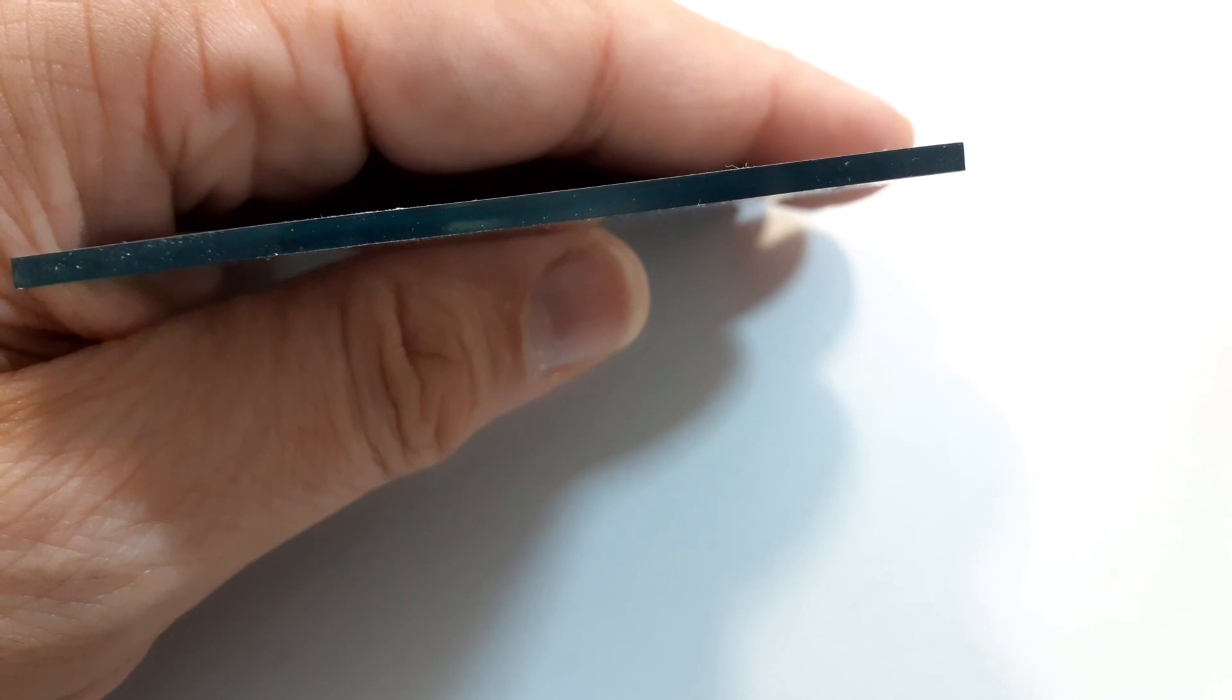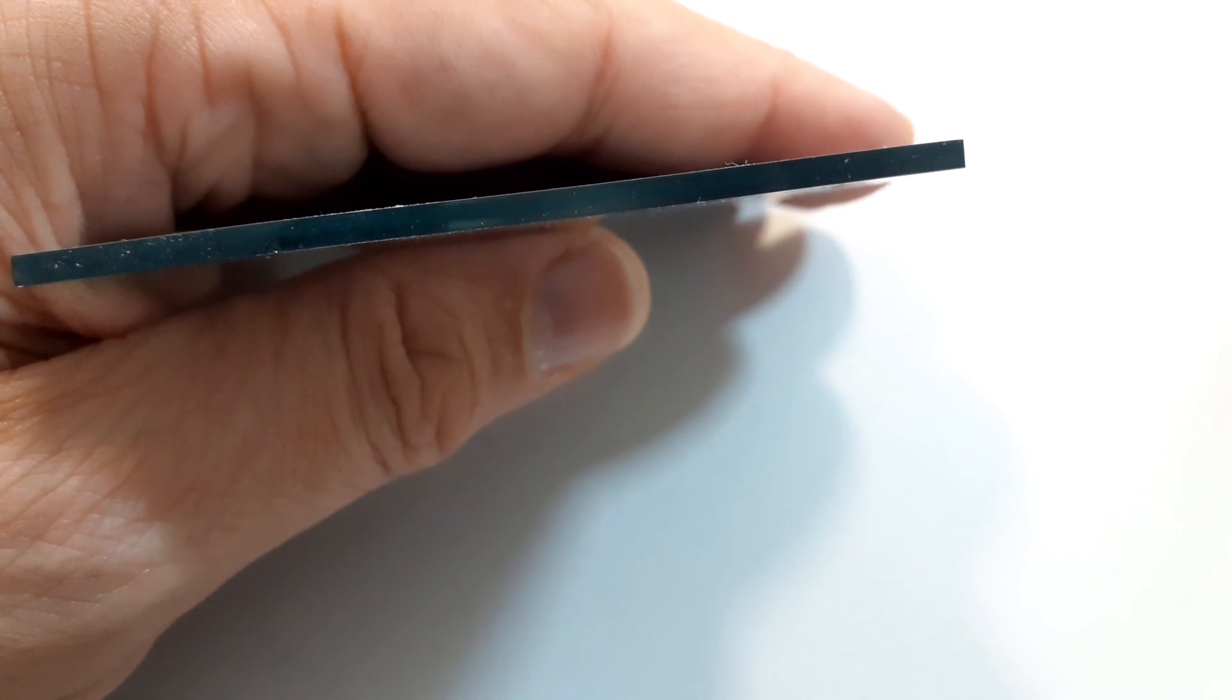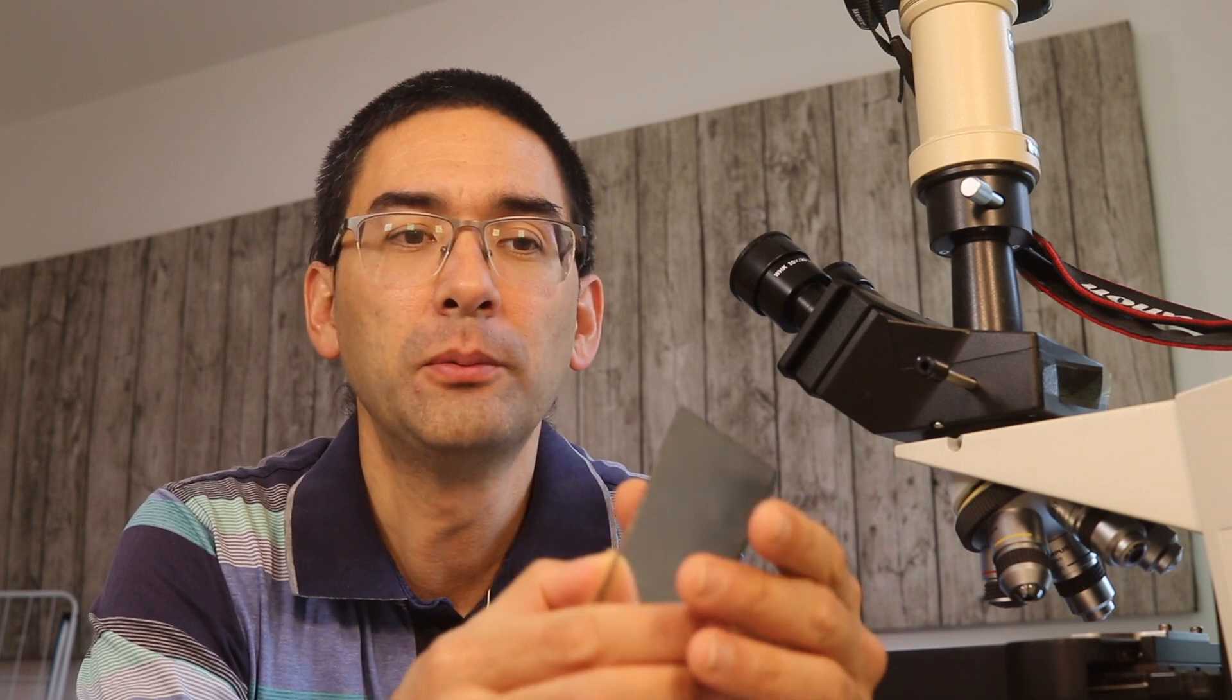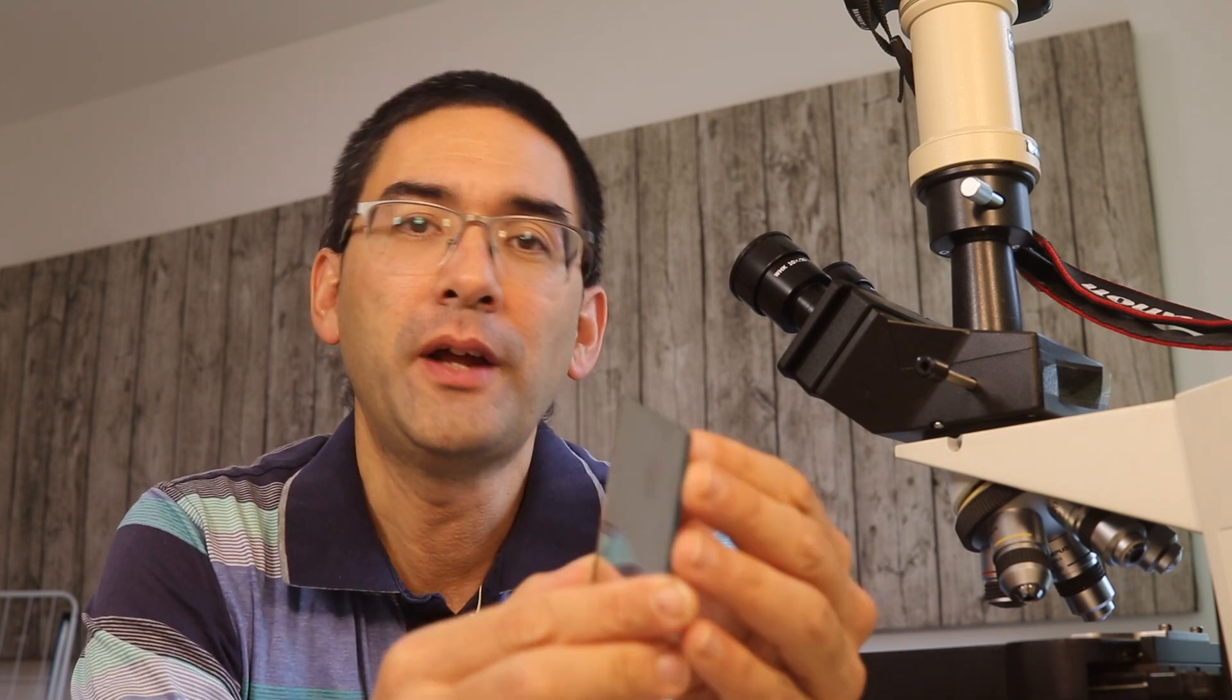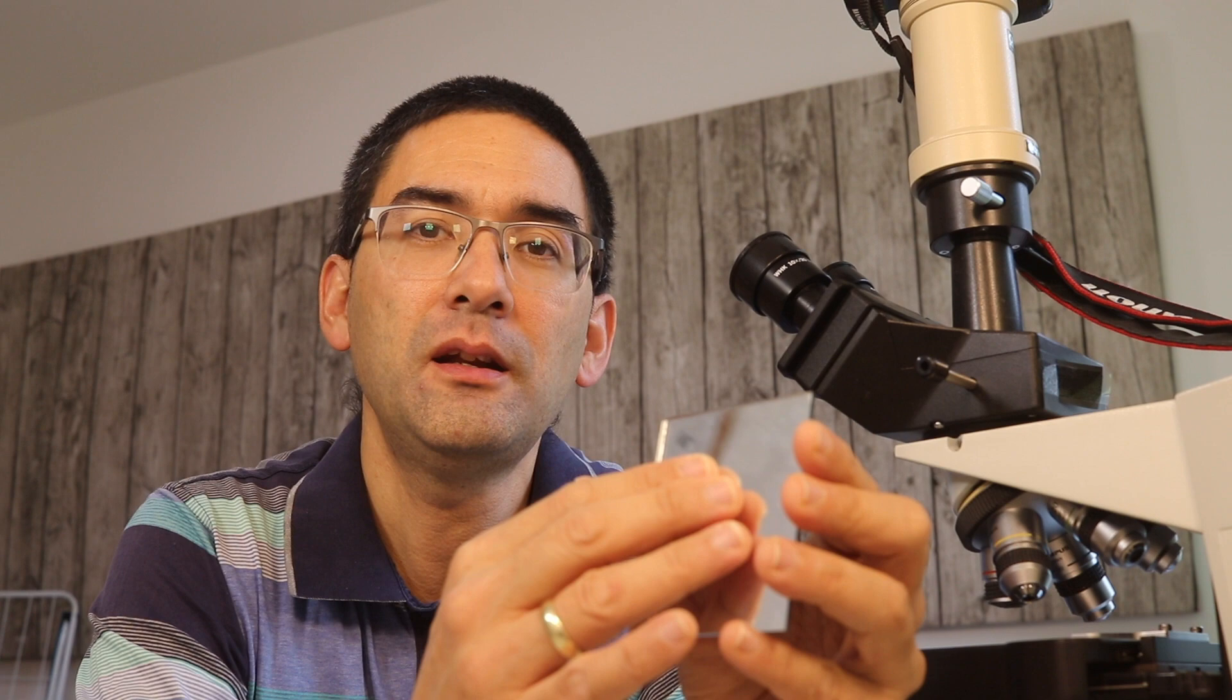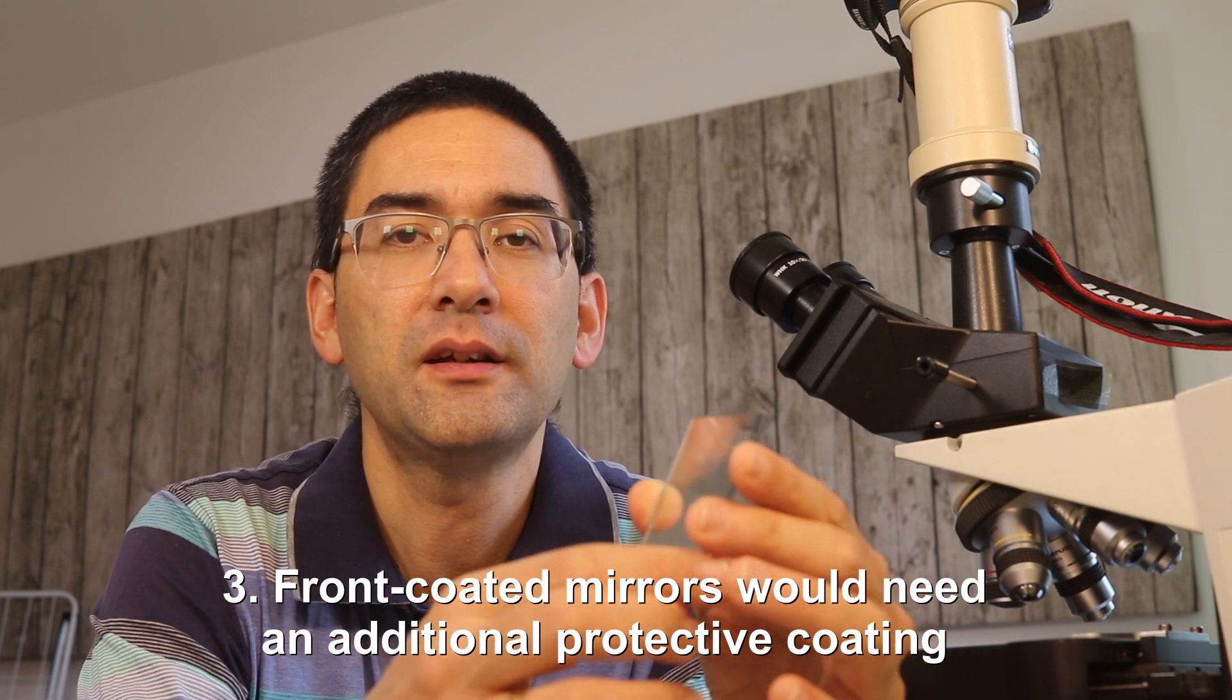So you have a total reflection happening just like in a prism. So that's a disadvantage and one way to solve this problem would be to actually not coat the back side of the mirror, but to do what you have in astronomy and when you make your telescope mirrors. What they do is to coat the front side of the glass with aluminum and this front side then basically directly reflects the light.